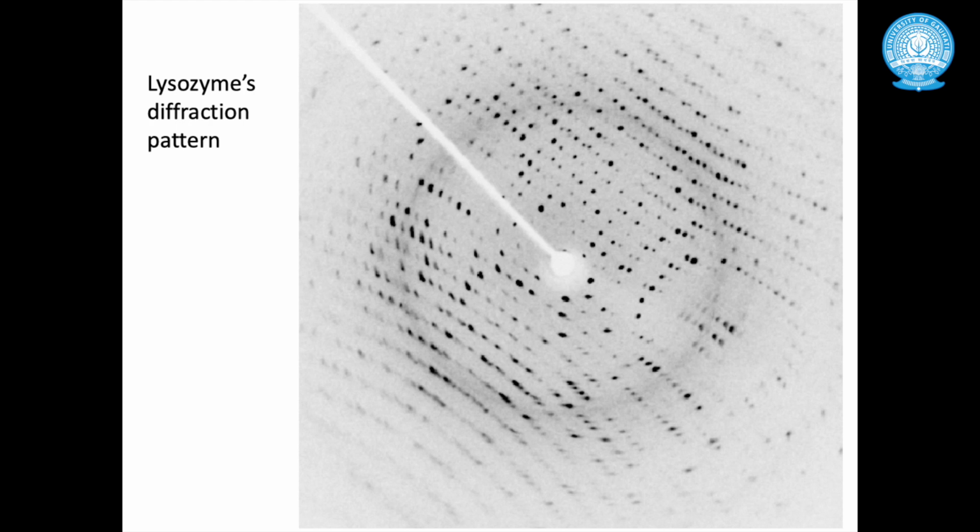So everything that we record using X-ray diffraction crystallography is down to the level of one covalent bond. Beyond this, we will not be able to use any other instrument to further confirm the structure. So this is how we characterize a compound.